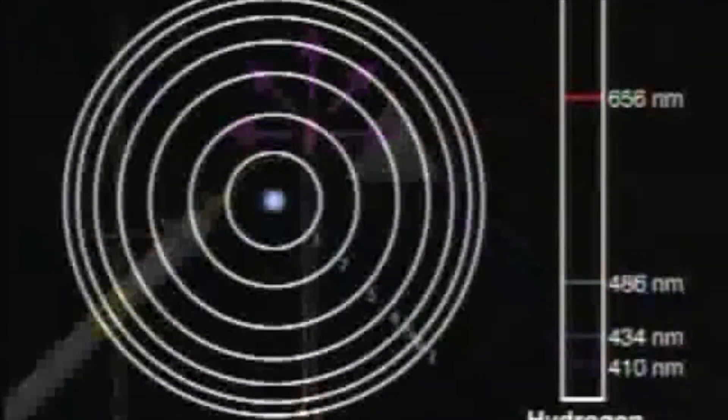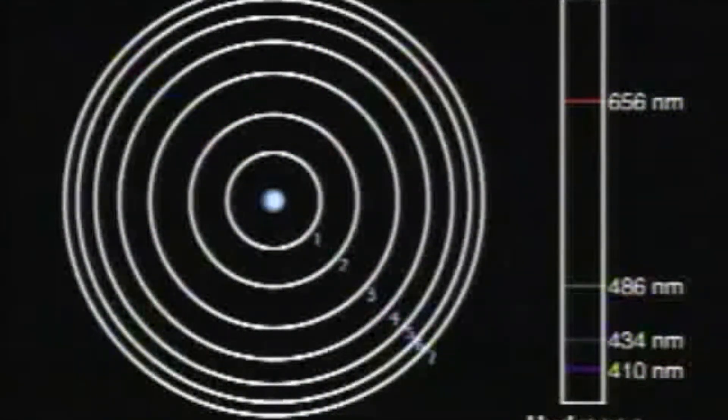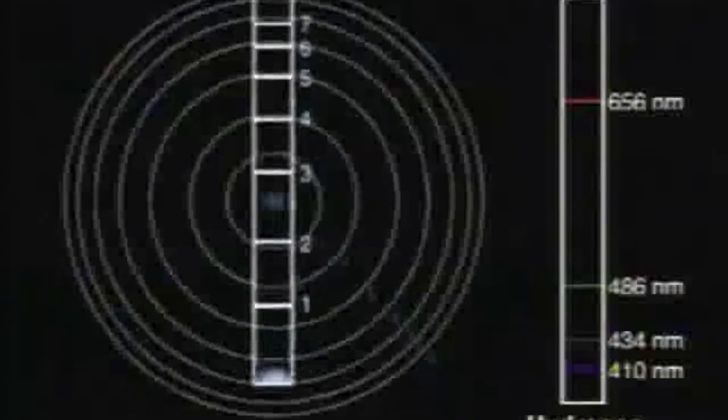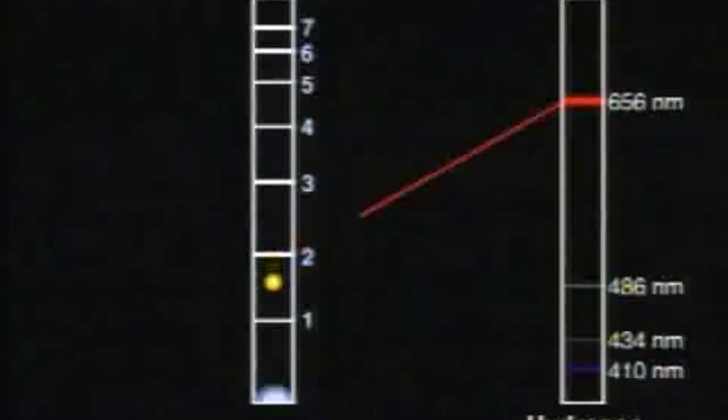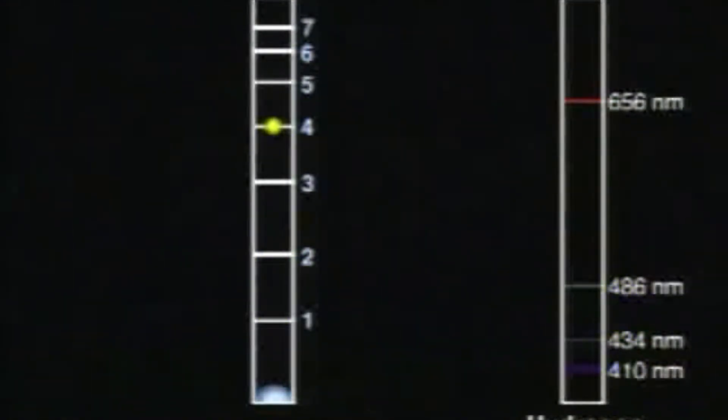A cross-section of an atom shows the energy levels similar to the rungs of a ladder. When energized, the electrons move temporarily to higher energy levels. As the electrons fall back to lower energy levels, they lose energy in the form of light, which produces the characteristic spectrum of the element.